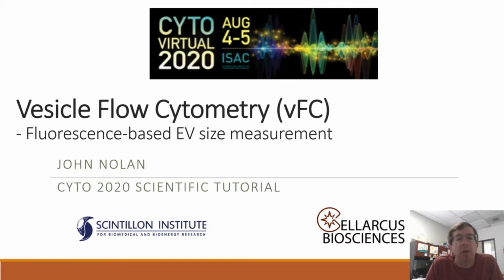My name is John Nolan, and I will wrap up this tutorial by telling you about fluorescence-based EV size measurements, which we perform using vesicle flow cytometry.